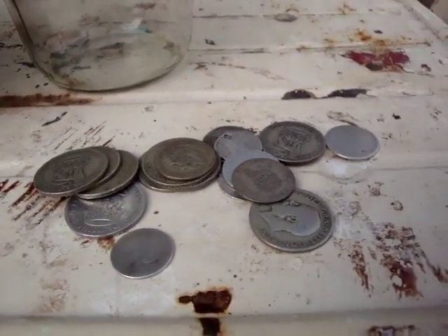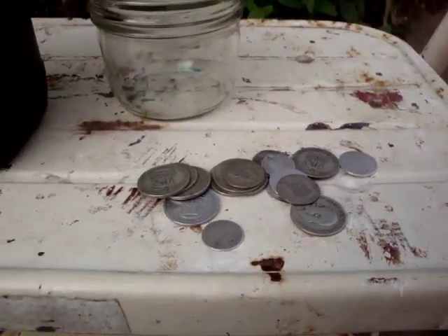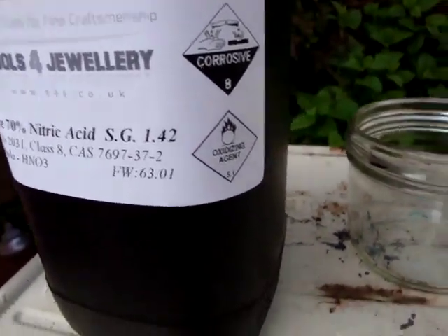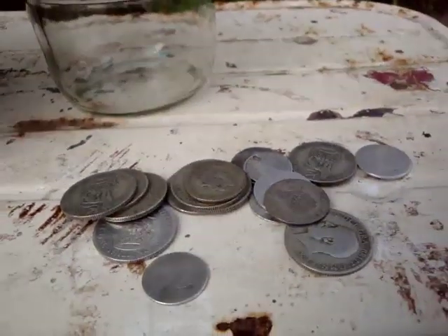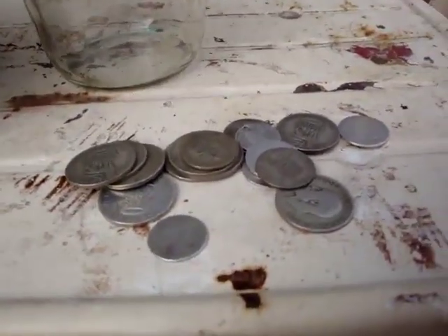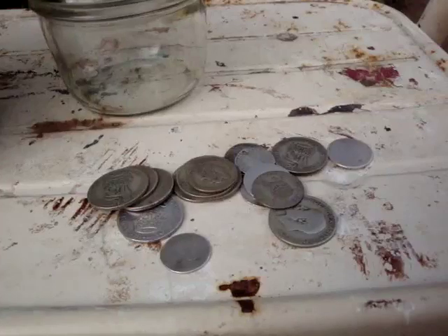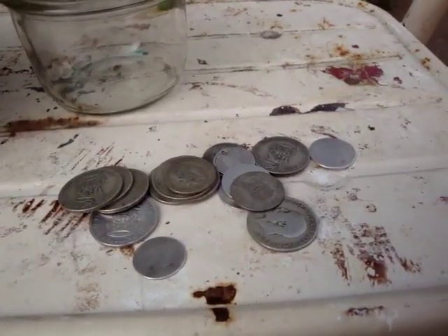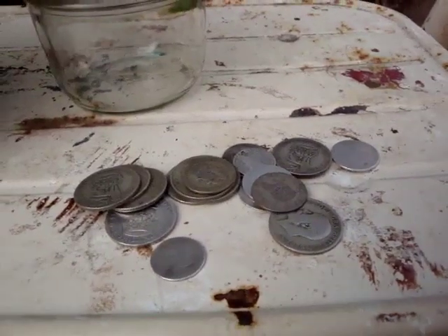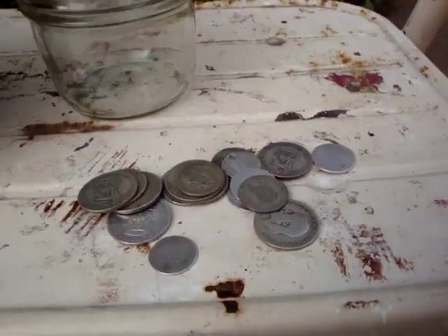I've never done it before, so it'll be interesting to see what happens. Safety, safety, safety - very corrosive, very dangerous. Make sure you're outside for a start, because this is going to produce a lot of fumes. And you've got some eye protection and some gloves maybe. Definitely some eye protection, just in case it splashes - you don't want it to splash in your eyes.